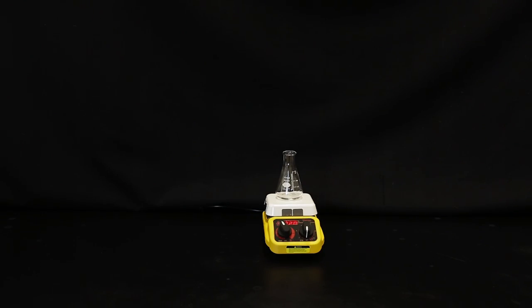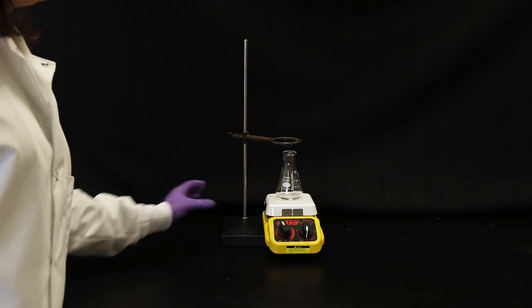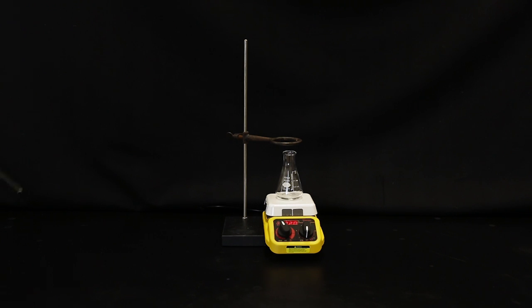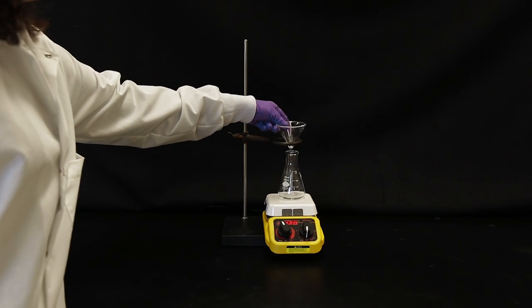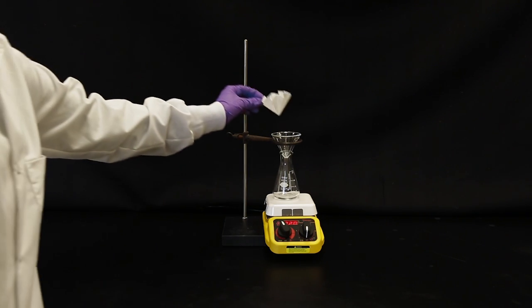To filter, place an Erlenmeyer flask that contains a small amount of the recrystallization solvent – in this instance, water – onto a hot plate. Place the glass funnel with pleated filter paper on top of the ring clamp and into the Erlenmeyer flask.